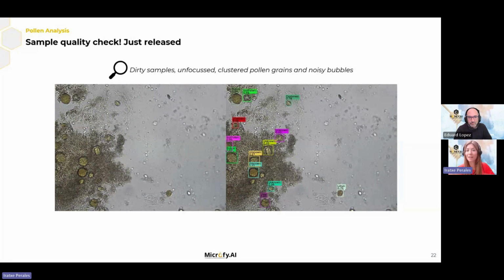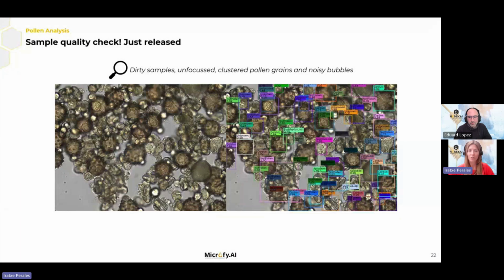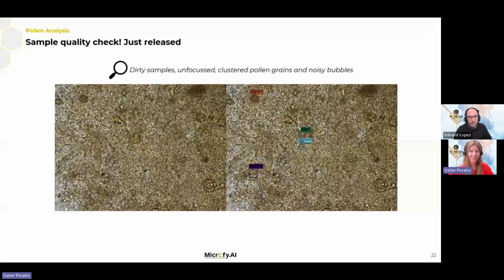Here you can see examples of fields that our microscope automatically dismisses. So if the system detects that a field is not able to be read, it just dismisses it and goes to another. But if during the analysis our system identifies a high concentration of non-valid fields, it will stop the analysis and tell the user to redo it. This is not correct. It means that the system is not able to read. So we will ask the user to dilute more or to use another type of cover slip. This is not readable even for a human.